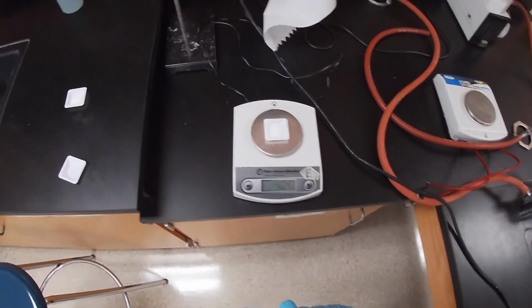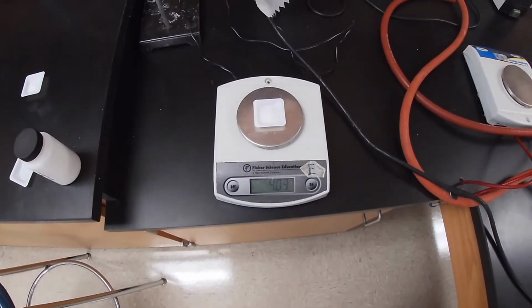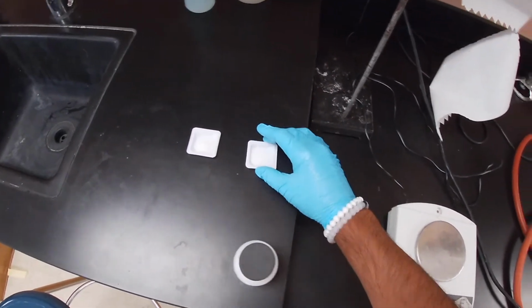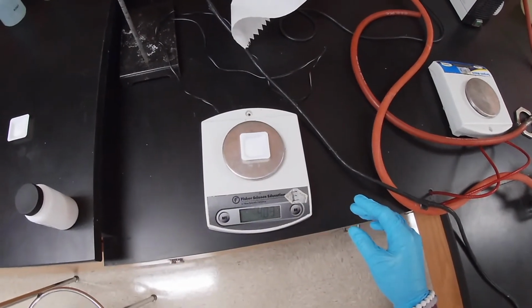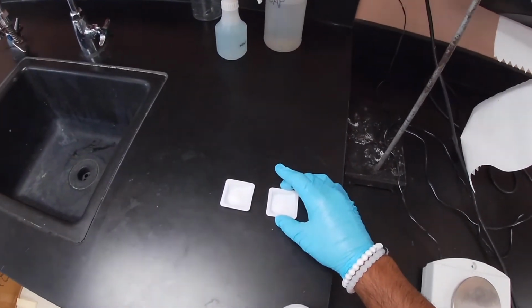Wow, I had it almost there. Anyways, so this one's going to be approximately 4.04 grams. Hopefully you can see. And then we're gonna go ahead and weigh 5 now. Whoops. Let's go ahead and put that one back on the scale to see if we lost any. We lost about 0.2. So just go ahead and record it again. 4.03. Be a little bit more careful this time.